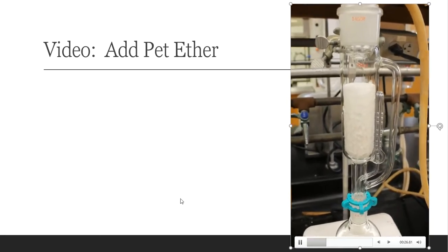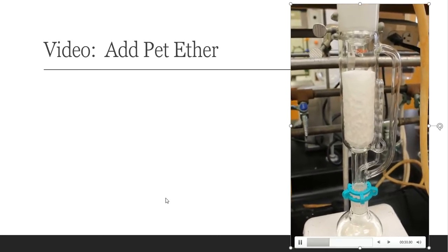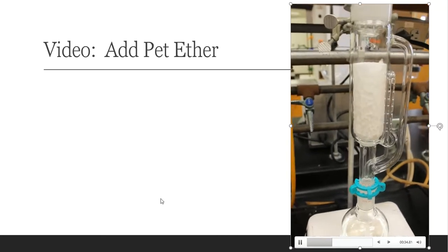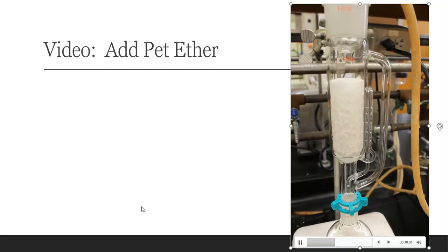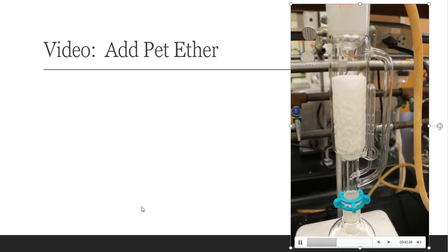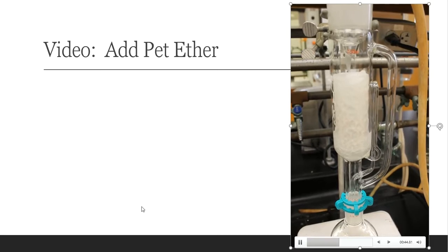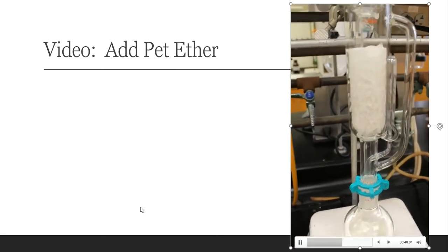So that looks like it just rolled over a little bit too early. So I'm going to wait until that stops. And now it has. You can see all of that liquid kind of went down to the bottom. And I'm going to pour a little bit more of that petroleum ether in, and I'm going to let it fill up. And there you're seeing it fill up, and it's going to drain at this point.